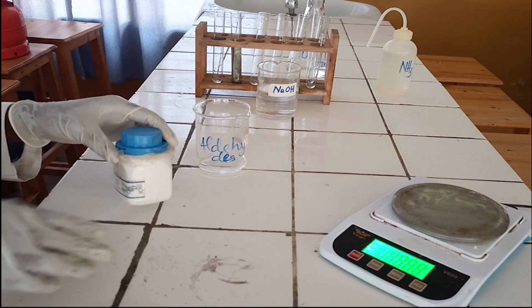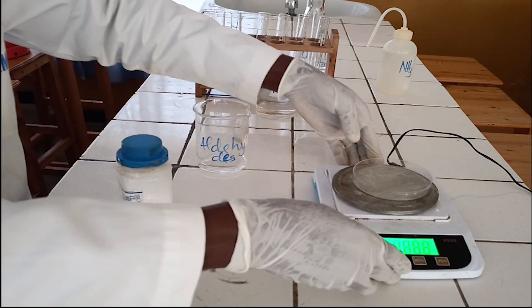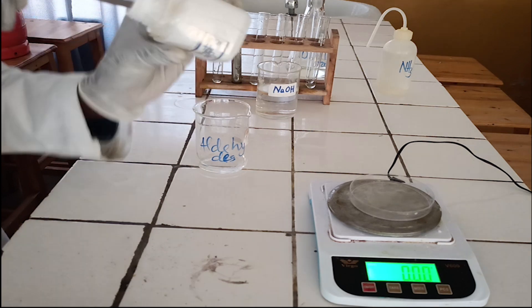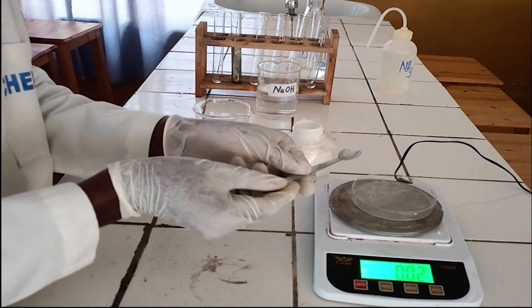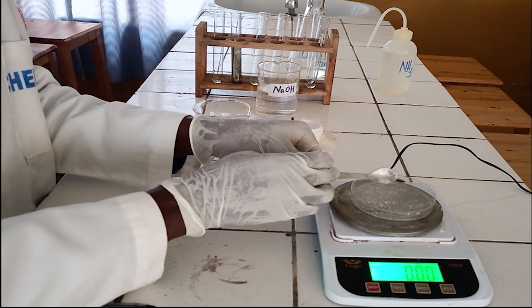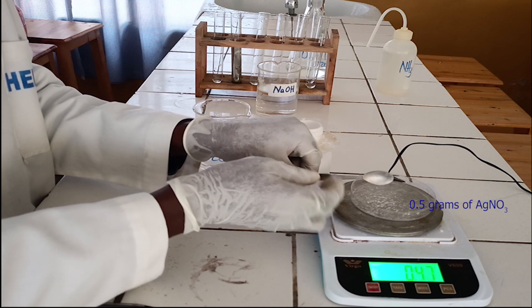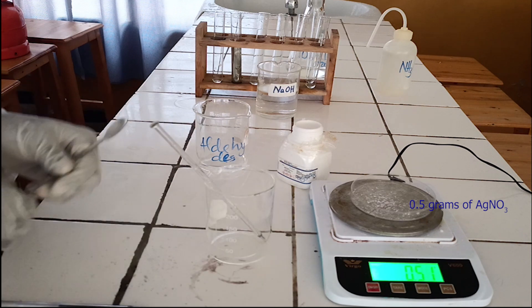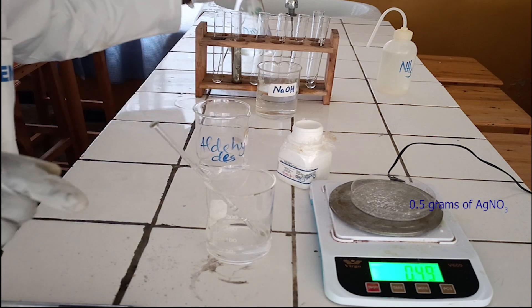The second way of preparation of Tollens Reagent. Set balance to zero and weigh around 0.5 grams of silver nitrate. Pour 50 milliliters of water in beaker and dissolve 0.5 grams of silver nitrate in it.